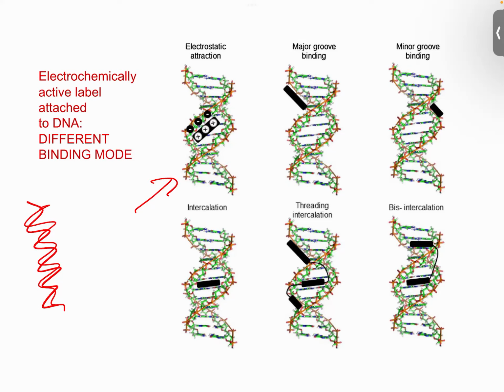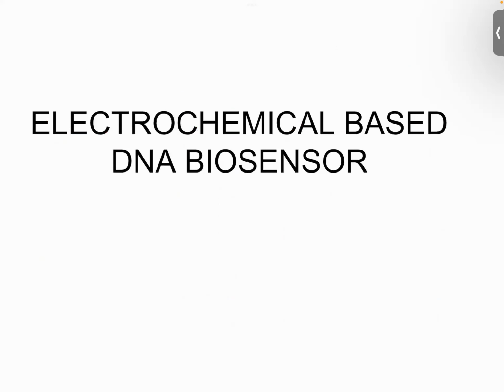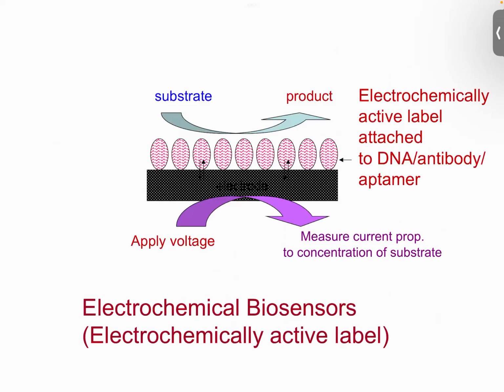But of course, you cannot look at the system and tell straight away, oh, this is 100% hybridization, this is 50% hybridization. We need an indicator. So in order to tell whether you have a perfect hybridization or probably weak hybridization, we need an indicator.